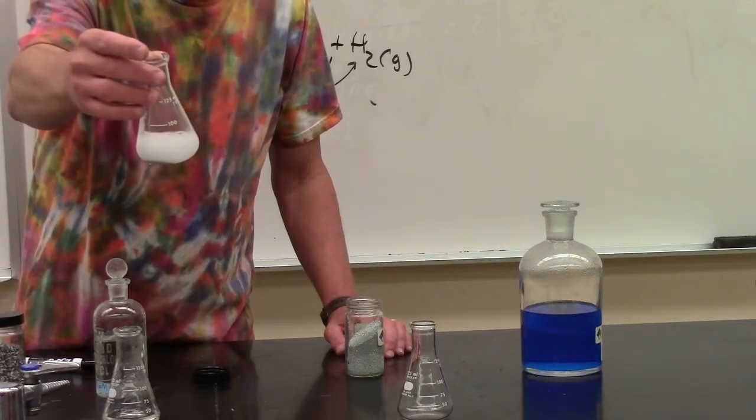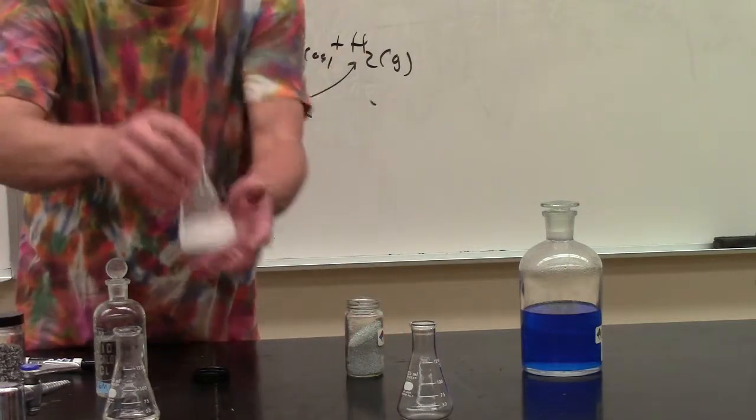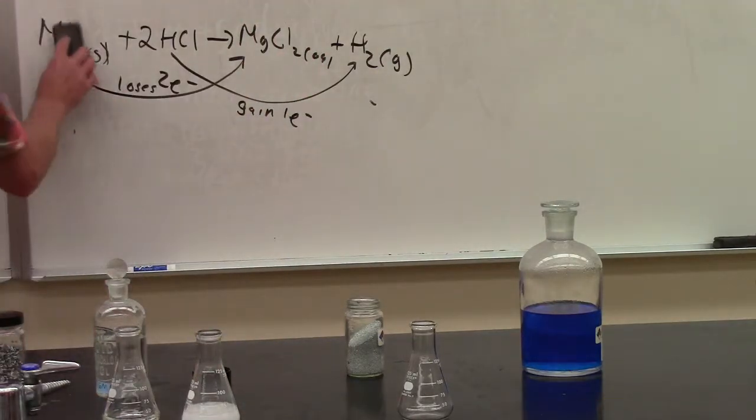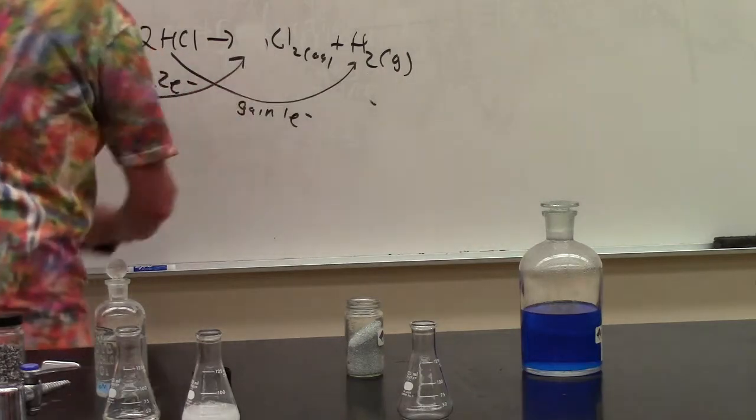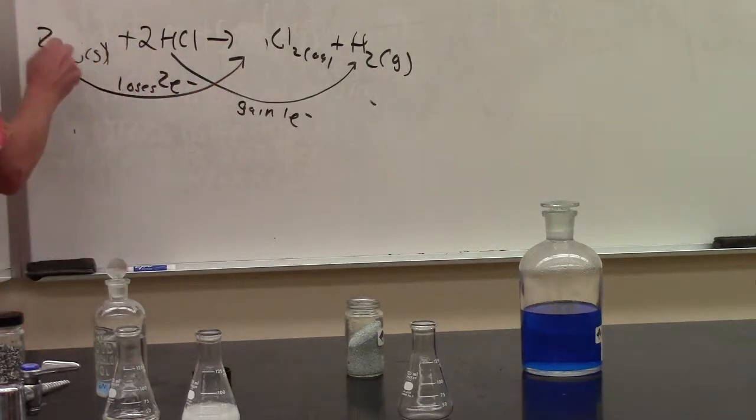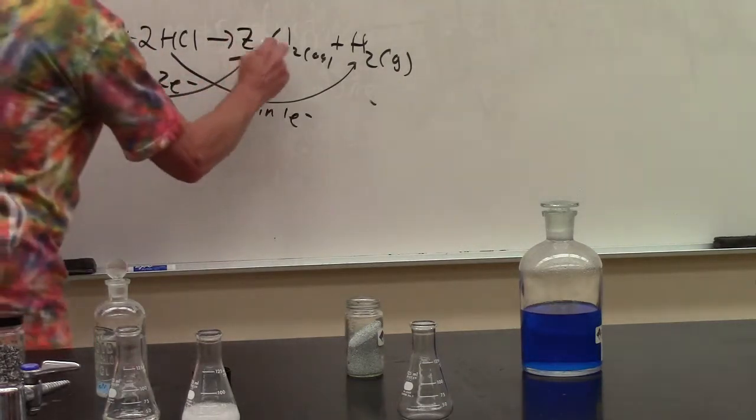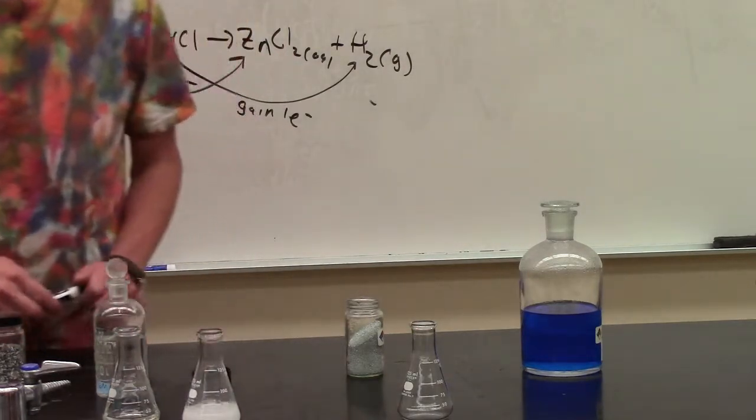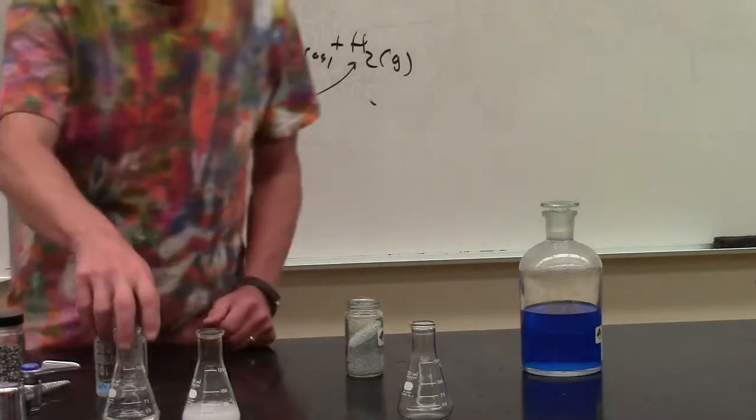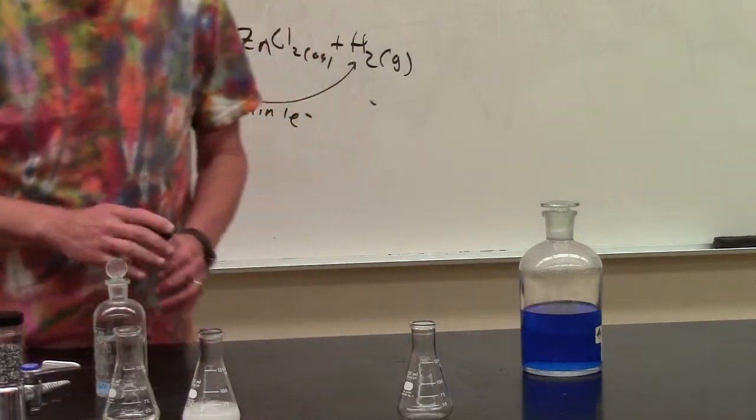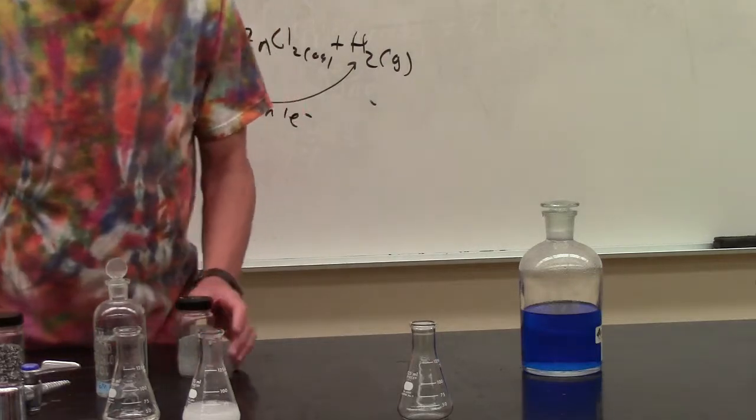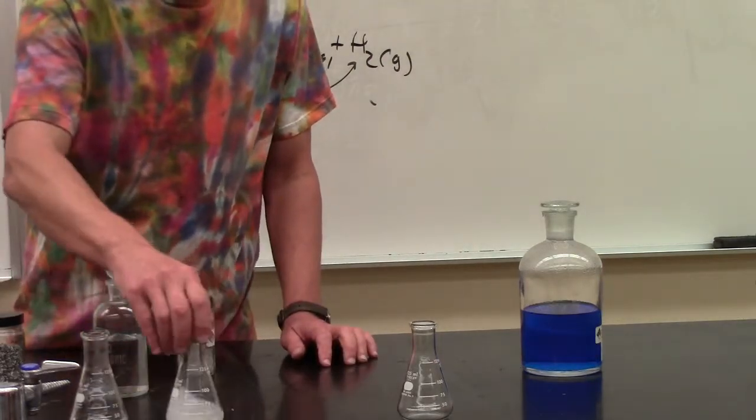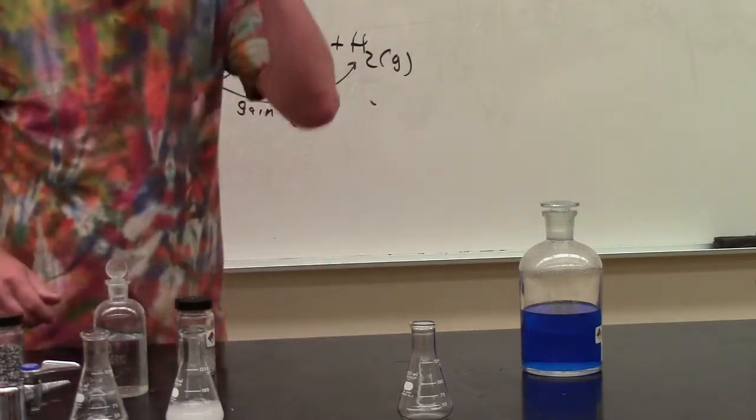It's producing hydrogen gas as well and getting warm. Basically the same reaction is happening. Instead of the magnesium though, I've got zinc here. The zinc will slowly dissolve. It's going to take longer because the reaction is not as fast. So many metals react with acid. In fact, only some metals are somewhat acid resistant. They tend to be very expensive, like gold or platinum. They are resistant to normal acid attack.